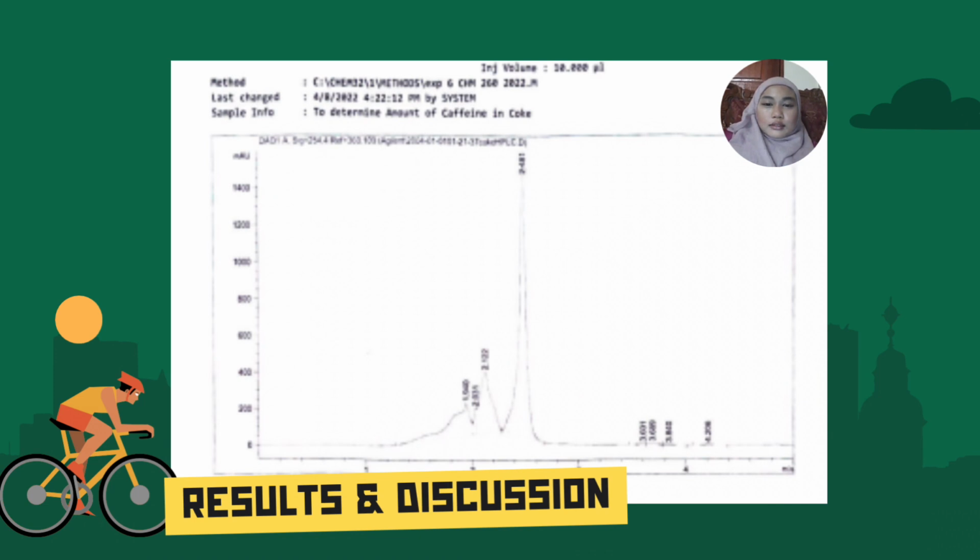Let's compare the first results and the second results. The first result represents a single peak with the retention time, width, area, and height, with the area percentage being 100%. This indicates a pure sample, likely the caffeine standard, as there is only one peak present, representing 100% of the chromatogram's area.